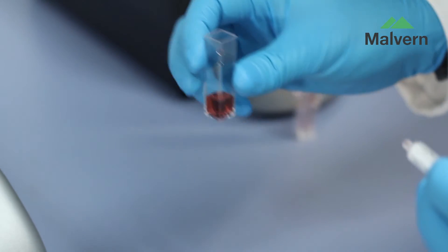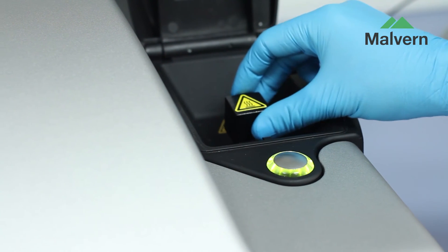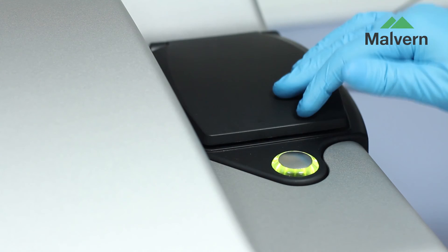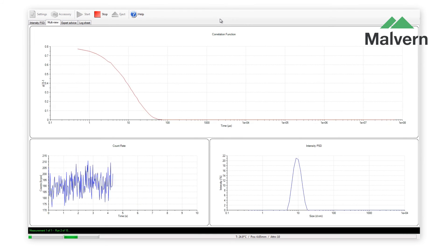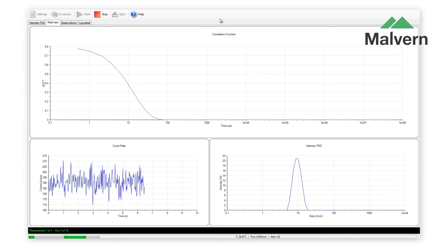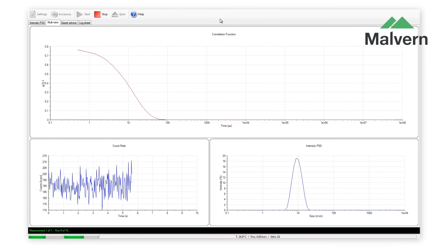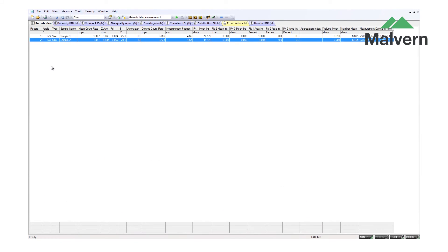I will now demonstrate how to make a size measurement. After filling the cell, it is inserted into the instrument, the heat cap fitted and the lid closed. Clicking this button starts the measurement. During the measurement, you can see the correlation function continually being redrawn as more measurements are made, as well as the developing size distribution. At the end of the measurement, the results are displayed in the records view of the ZetaSizer software.